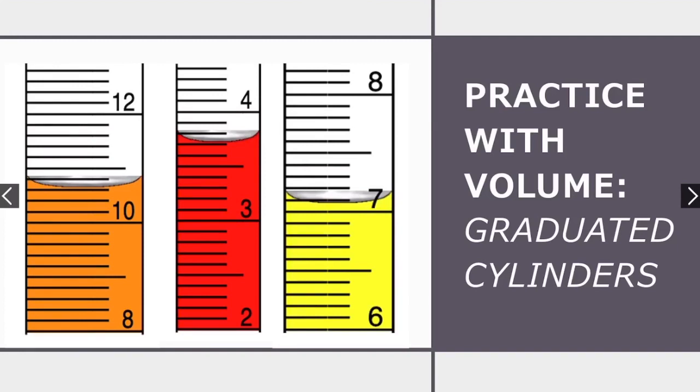All right, so let's go ahead and practice reading volume on graduated cylinders. Go ahead and pause the video for just a minute and make your best measurements of these 3 graduated cylinders. When you come back, we will go ahead and talk about them.